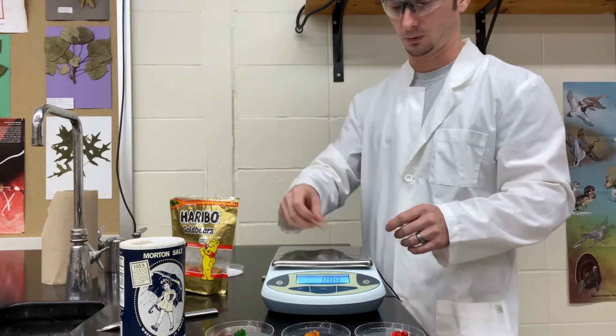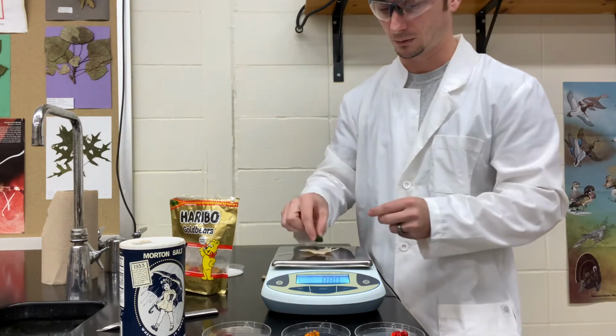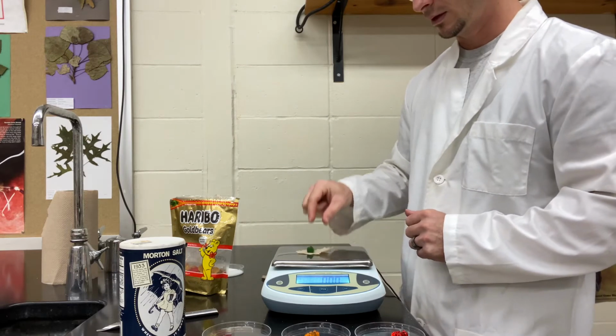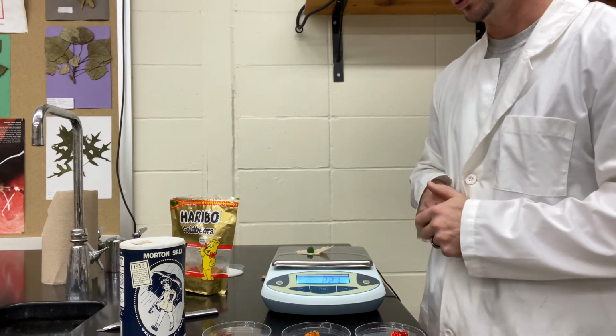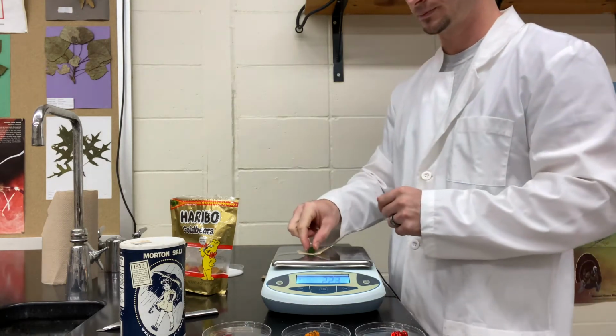All right, so the first one up is going to be our control group, Mr. Green. Yay. Okay, so as we put him on there, we have to zero the scale. Mr. Green's starting weight, which is our control group, is 2.21 grams. So write that down.